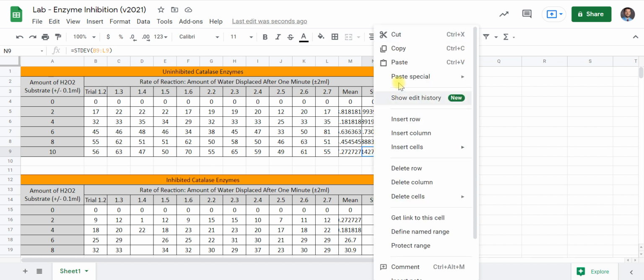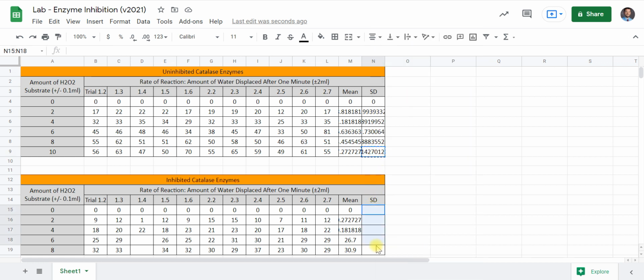And again, I can click and copy this cell here, and I can either do it all manually or I can just come and paste it and save me time. Next thing, we're going to highlight these here, and we're going to come over to the rounding option. And it looks like I'm going to have to round these. You can see how that number does this. I'm going to go ahead and round these, and it looks like I'm going to round it to about 2 sig figs.